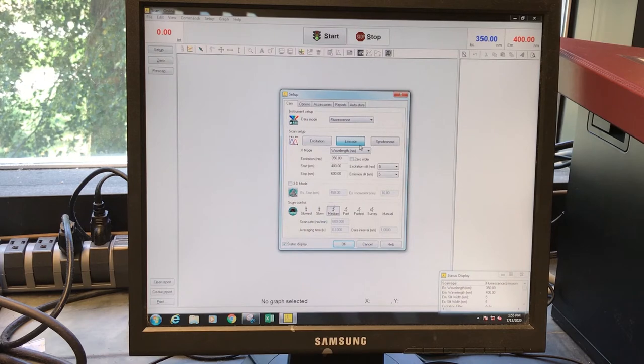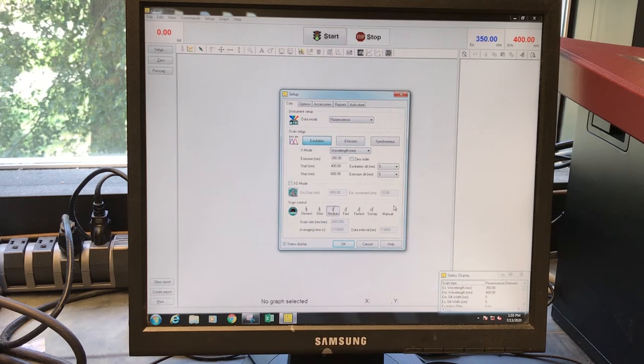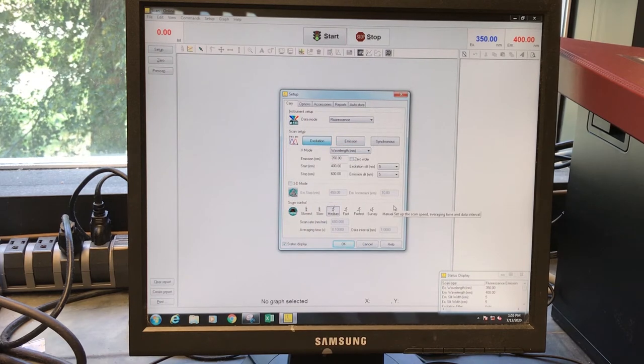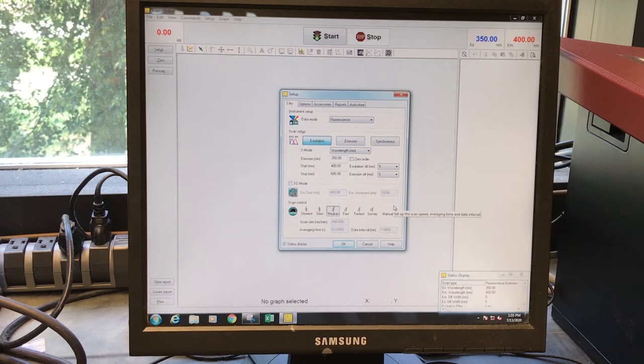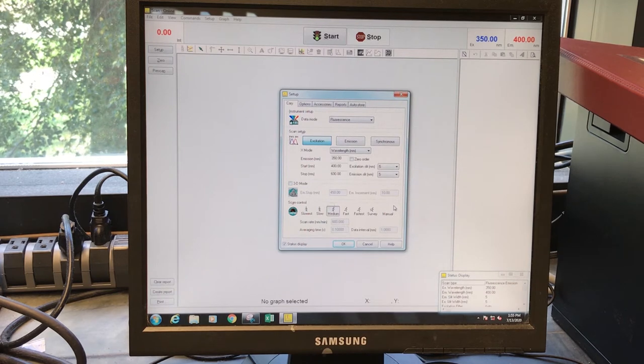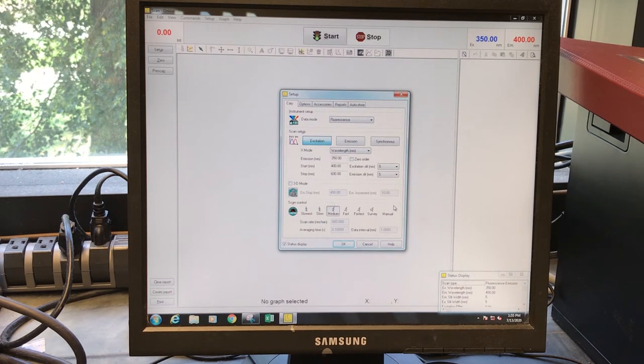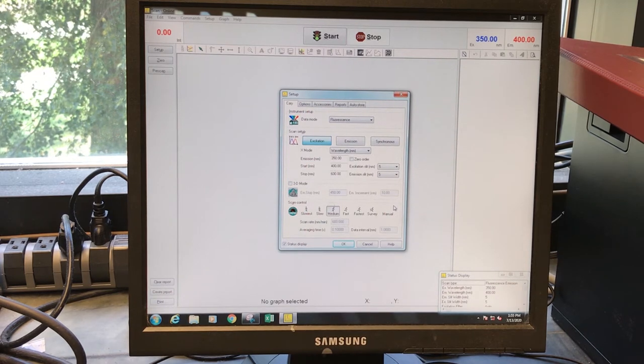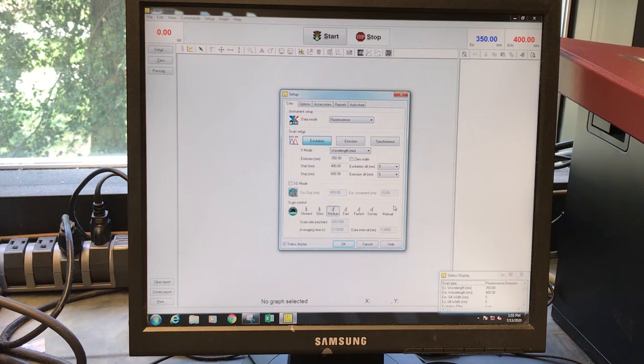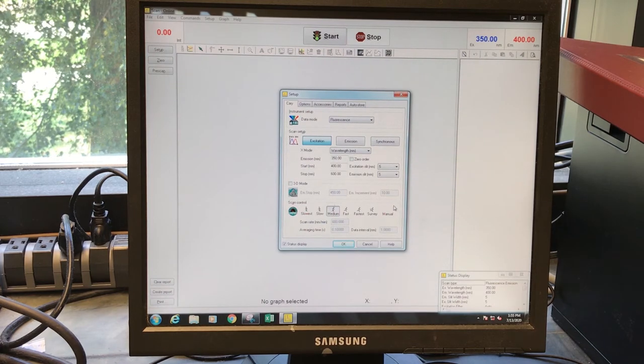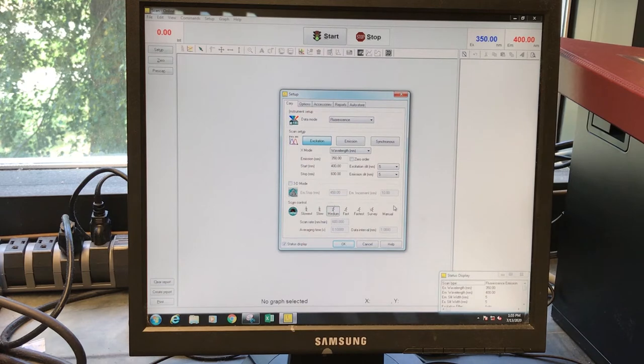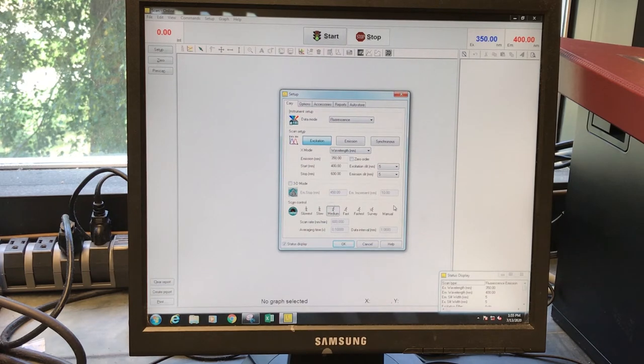You can also do an excitation scan where we change the excitation wavelength across a range of wavelengths and collect the emission at a particular wavelength. With both of these, you end up with a spectrum. They tell you different things in terms of the information that they can give you.